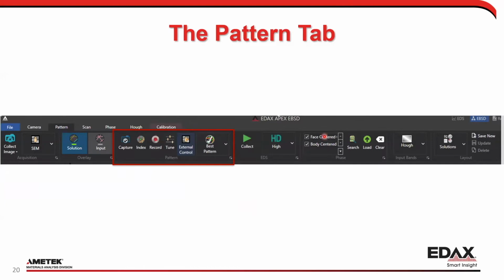The other thing here is going to be this little tab over here. I forget where I talk about it in this presentation, but I do talk in detail about this. This is also where you can see the EDS is available. So I click on EDS and I can collect it. Relatively straightforward.